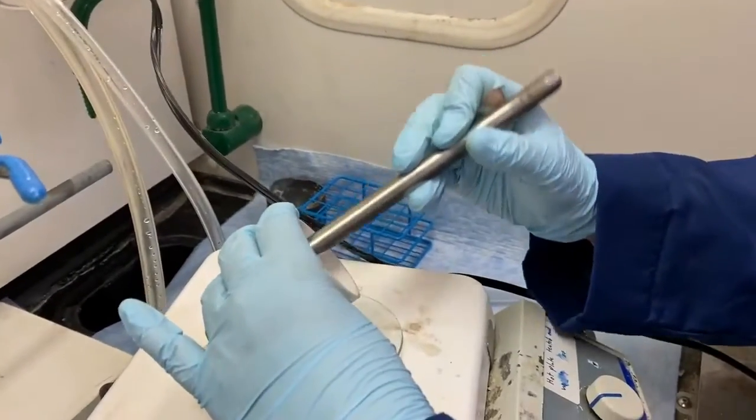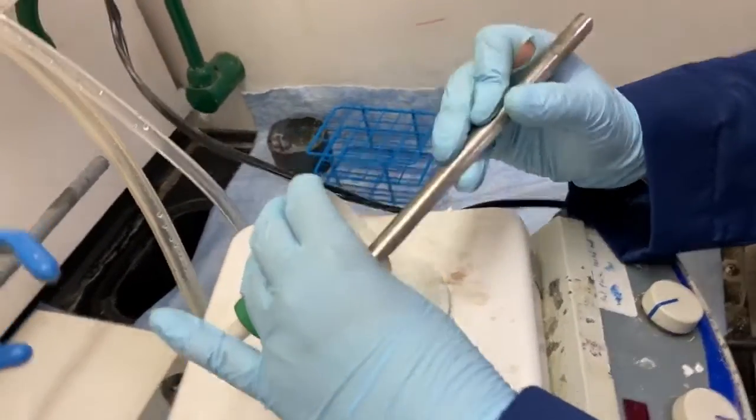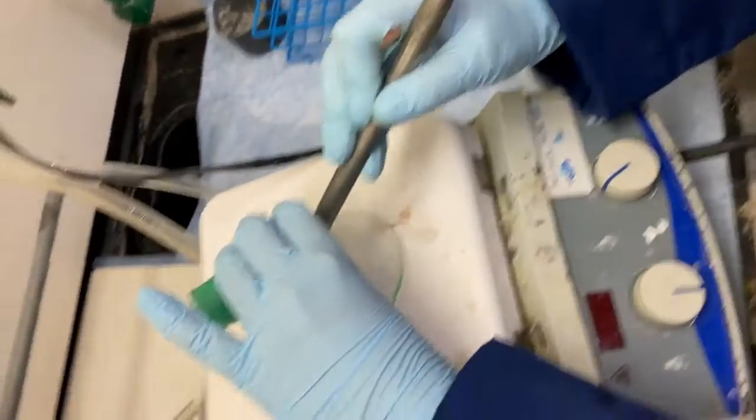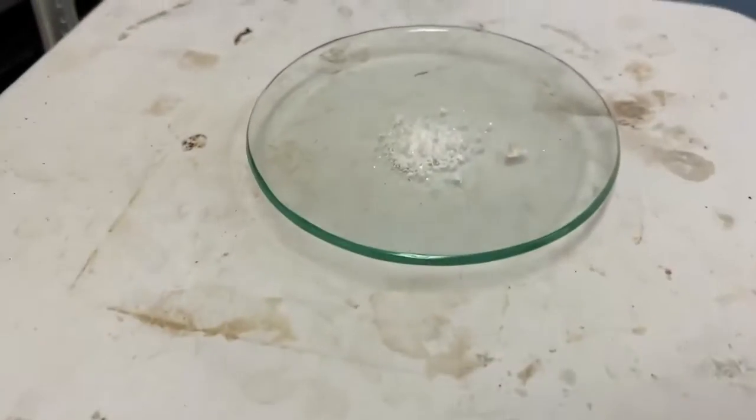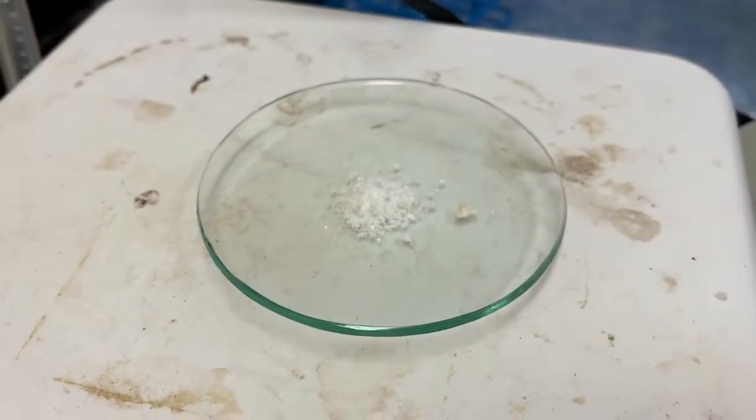And then we're coming out and getting the crystals. Okay, well, it's hard to see. Her hand is in the way. That's not a horrible yield. Okay, and so again, we're going to let these dry.